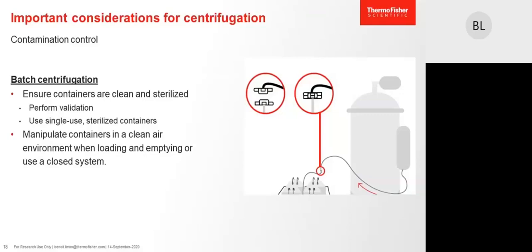And of course, manipulate the container in a clean air environment when loading and emptying the system. The container, the system, or use the closed system from the bioreactor to the container, centrifuge, and through the workflow.